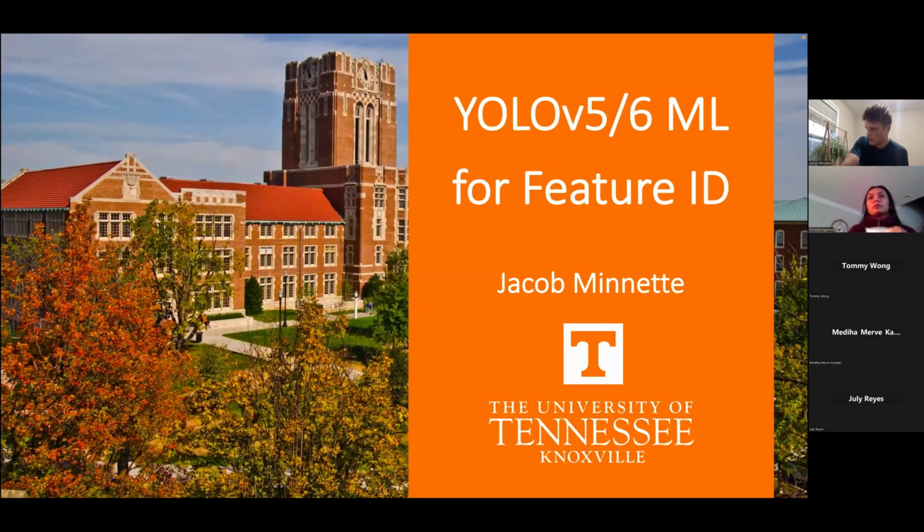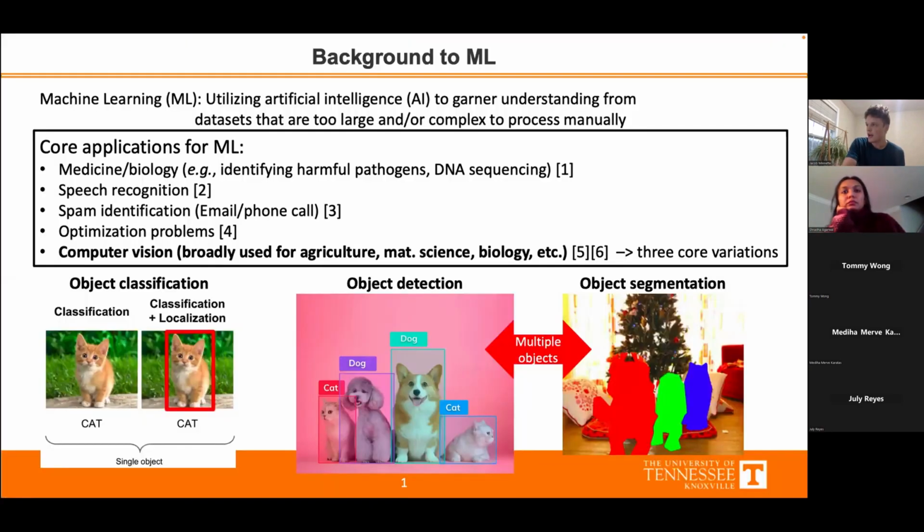So my presentation is over YOLO v5 as well as YOLO v6 for computer vision for feature identification in transmission electron microscopes as well as related applications. So just getting into a very quick background into machine learning.